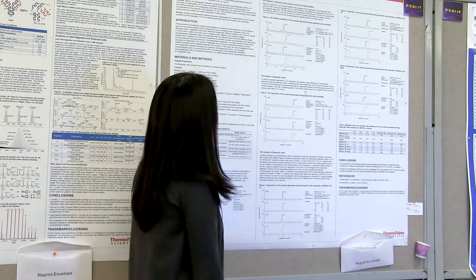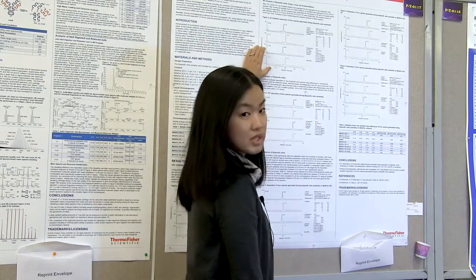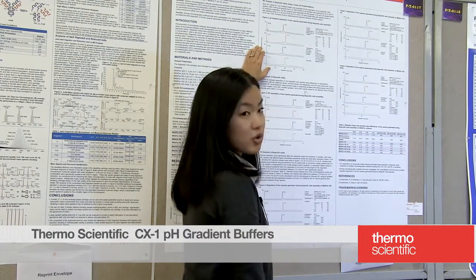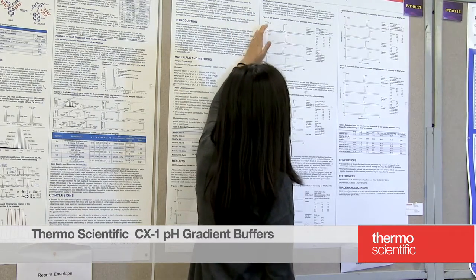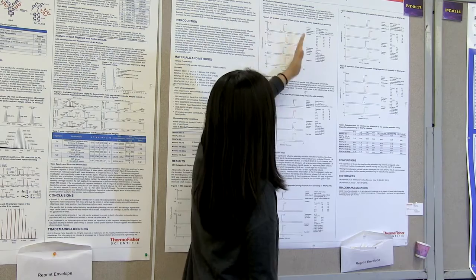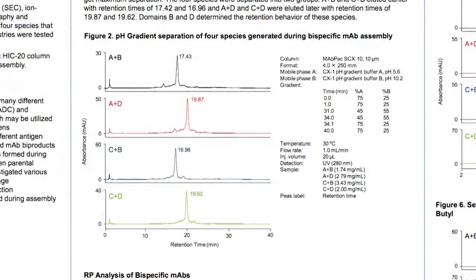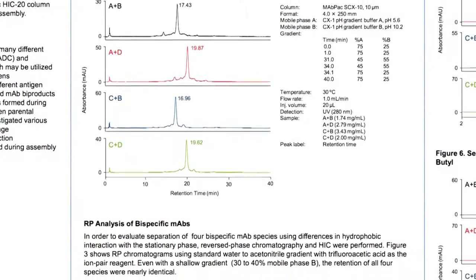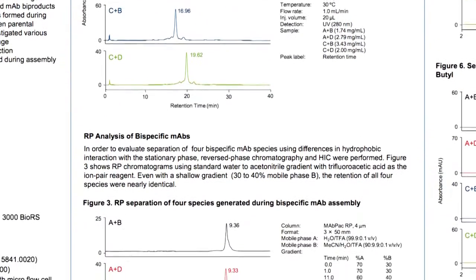And then we tried ion exchange chromatography, so we did cation exchange chromatography with our CX1 pH gradient buffer. In this case, it was interesting to see that we were able to separate it into two groups, A plus B and C plus B samples. We were able to see that they come out a little bit earlier, and then the A plus D and C plus D samples came out a little bit later.